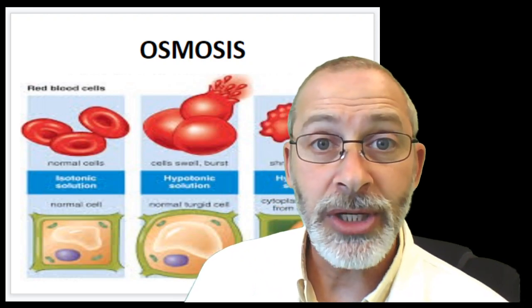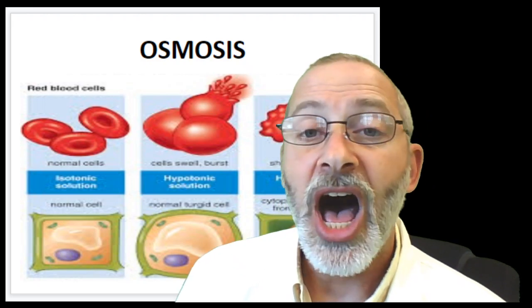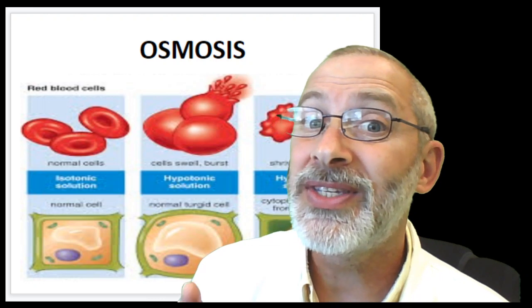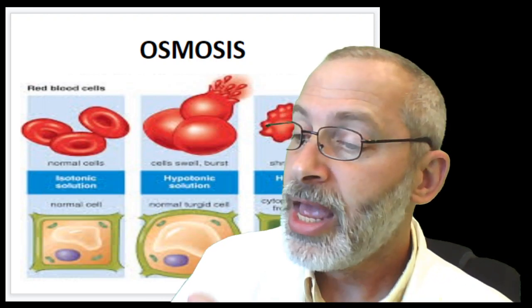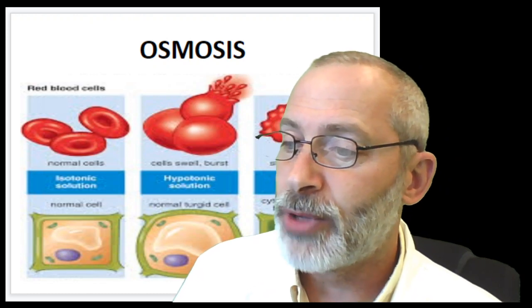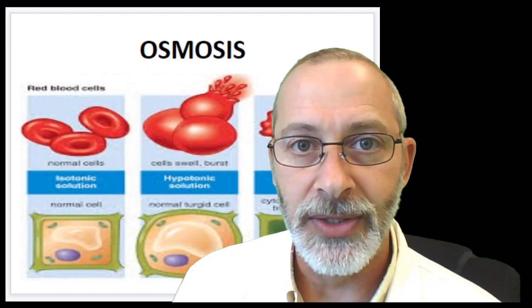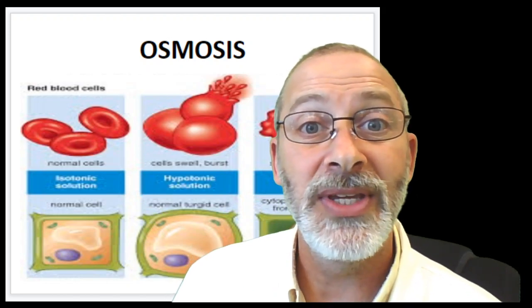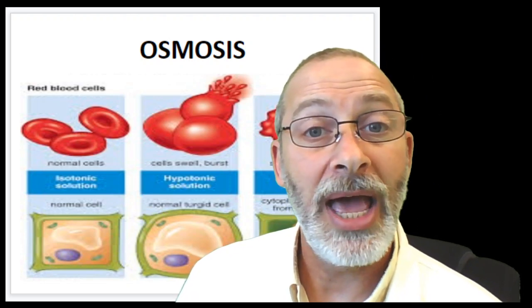So the question here is, how do you expect to observe osmosis? And remember what osmosis is. Think about its definition. How do you expect to observe osmosis taking place with dried raisins? So take a moment and write your hypothesis now while I head over to the virtual lab.